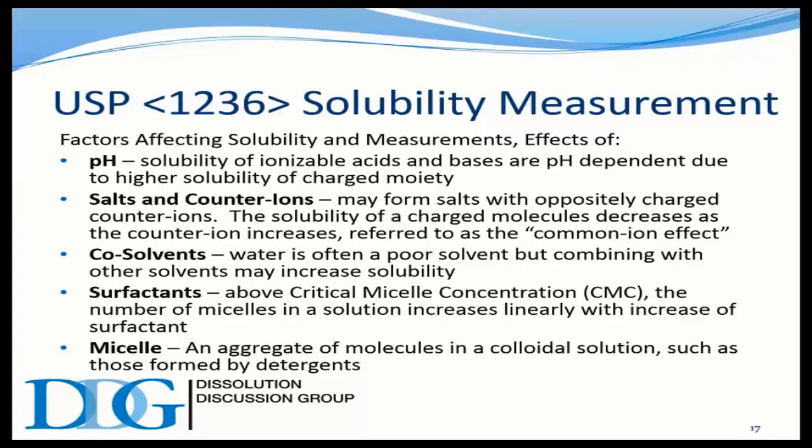Co-solvents. Because water is often a poor solvent for some small molecules, combining it with other solvents may be necessary to increase solubility, again as a last resort, but that's usually when everything else has failed. I probably should have put that last, I guess.